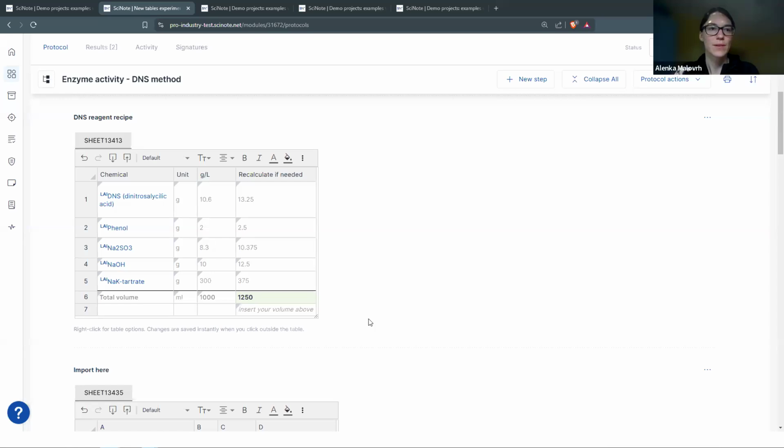All right. Okay. So someone said they started using it recently and they are still exploring it, but so far they mostly added some PDF files to the results. And when they wish to view it, it's a bit blurry on one page at a time. Is there a plan to update the embedded PDF viewer in the near term, such as continuous scrolling as an option, and regardless of the magnification, it is not blurry? So not quite on the tables, but Alenka, if you want to answer about what in the future, if this is something that you guys have considered.